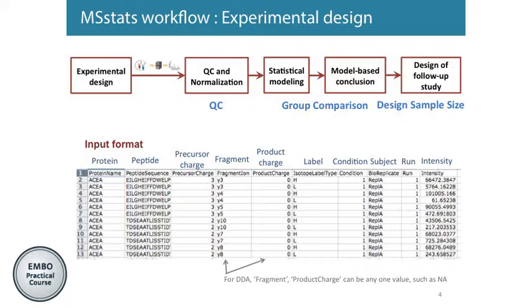First, this is the main step for statistical analysis, getting to the conclusion. But before that, we need to check quality control and the normalization step, and you also need to double check before you get your correct conclusion. And then this one is the last step. For each step, MSstats has functions and visualizations. At the bottom, we can use MSstats as an external tool in Skyline.